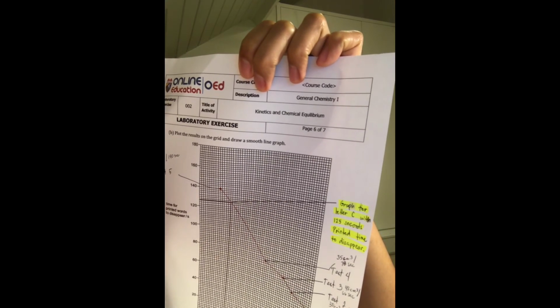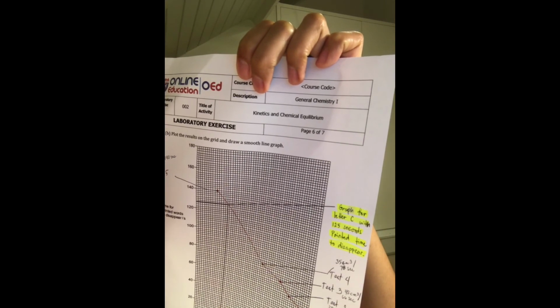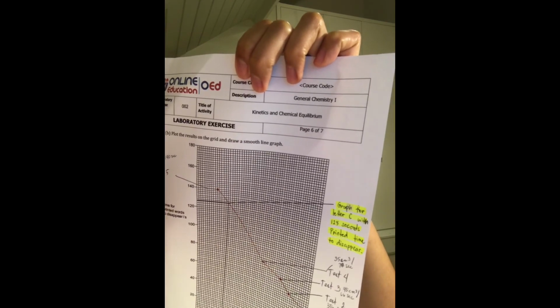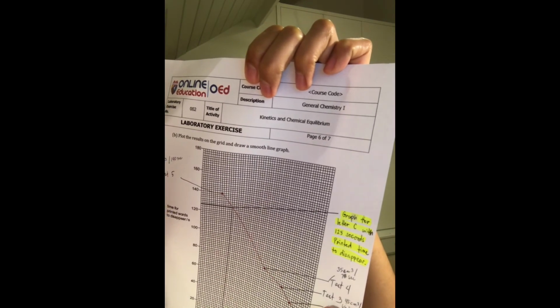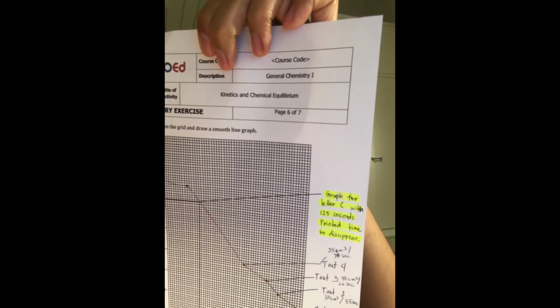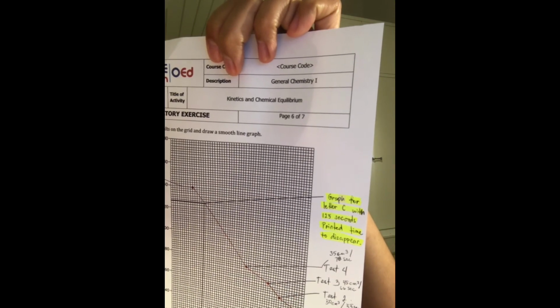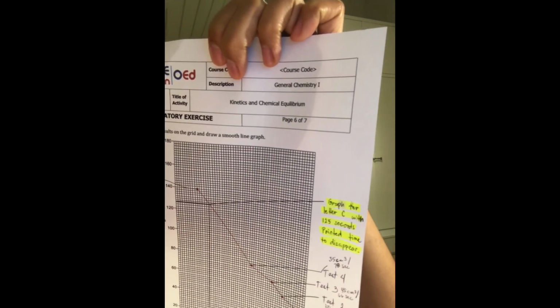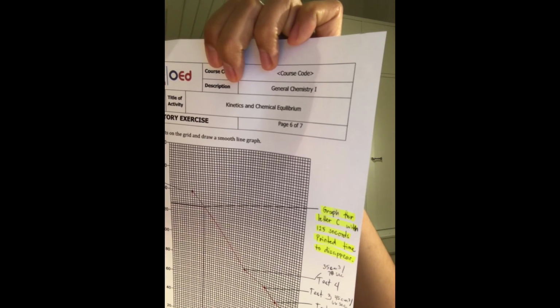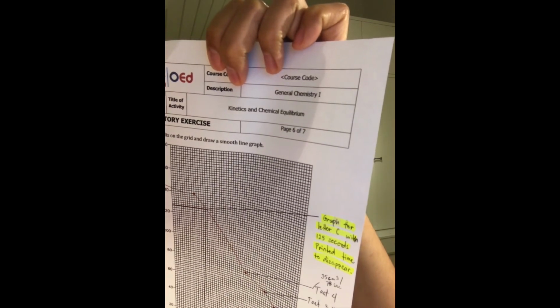Same goes with test 2. I have recorded 50 cubic centimeters with 55 seconds time for printed words to disappear, and test 3 with 45 cubic centimeters and a recorded time of 66 seconds, and test 4 with 35 cubic centimeters and a time of 78 seconds.